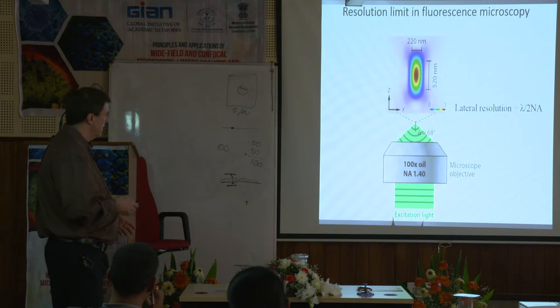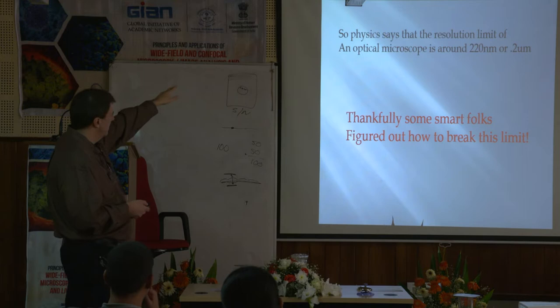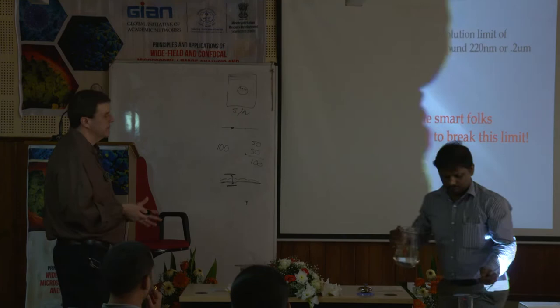But, of course, there's some smart people out there, and physicists were saying, you know, around 220 nanometers, 0.2 microns, but thankfully, some smart folks figured out how to break this limit, okay? And, of course, we have to pay homage to them for their work and being able to do this for us.